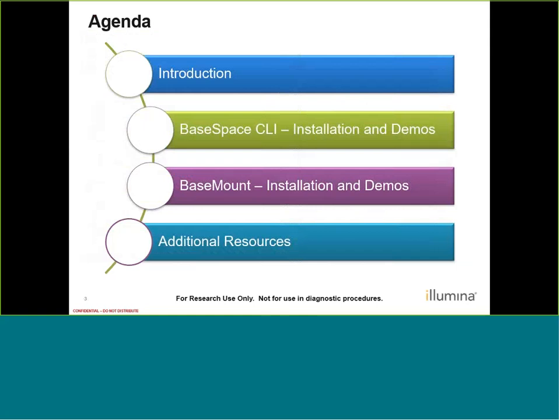Here is our agenda. First, I'll provide an introduction to each tool, discuss their intended use and their requirements. Then I'll discuss BaseSpace CLI exclusively, which I'll refer to just as CLI from here on out. During this portion, I'll also talk about installing and authenticating CLI to use with your BaseSpace account. After that, I'll provide demos for real CLI use cases. Keep in mind, the demos will mostly be on the Windows command line, or CMD, but they will be the same for macOS and Linux. I'll also make sure to point out when they're different for those systems.